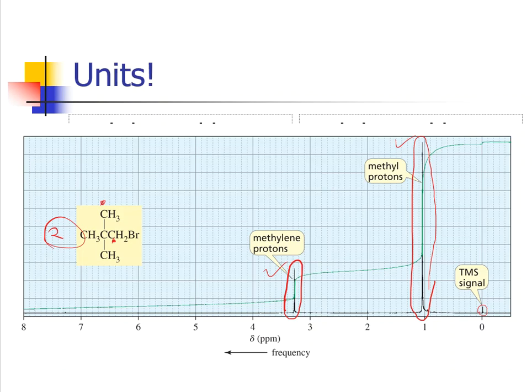So here on the computer screen, you'll see an image of an NMR spectra that we worked with in the last video. And there are two major signals, and we talked about where those signals come from, or really what we call chemical shifts. And we also talked about this unit of part per million, which is down here at the very bottom. So that part per million is actually in terms of hertz and megahertz, and that's how we calculate the typical 0 to 12 x-axis that we normally see.